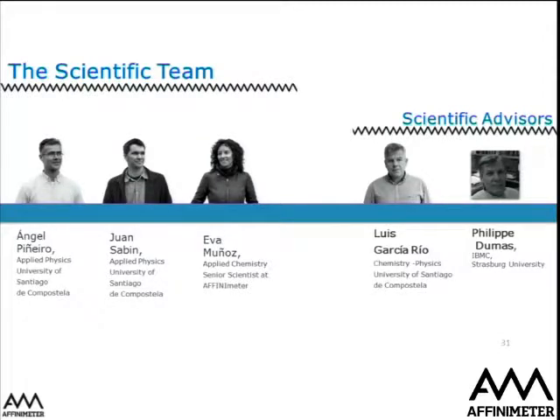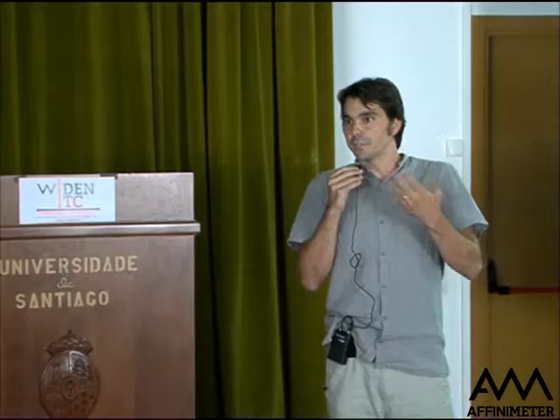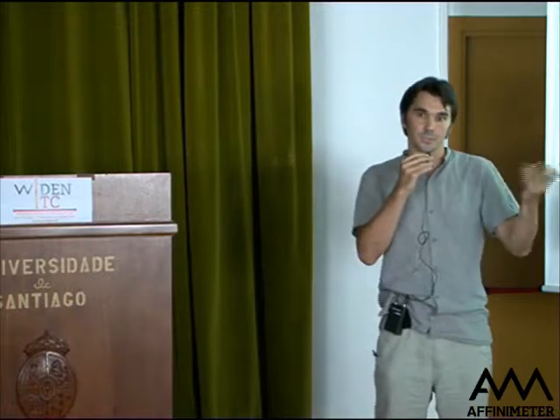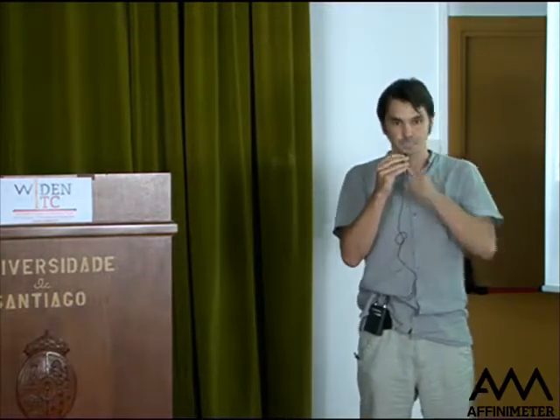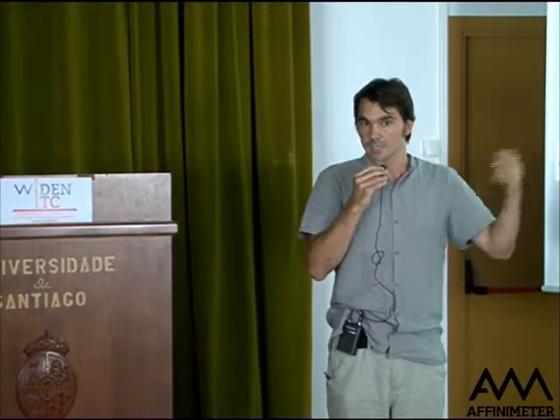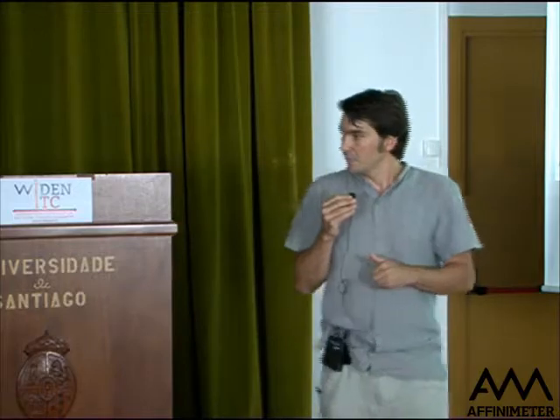I really think that there are more things that people can do using ITC, but you need the right binding models. I know that mostly people are using ITC to just calculate KD with a simple one-to-one model, but I really think that if we develop more software, more binding models for ITC, there are even more chances to increase the number of users and to increase the market for food, industry, and cosmetic research. I think micellization models or aggregation models will be very interesting. So that's all. I will be very happy to get some questions.